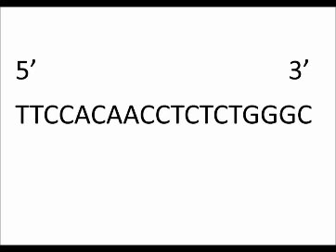So they're the 6 criteria that you're going to use to refine that list of primers down so that we can make sure that we only use the best microsatellite regions for our DNA profiling.